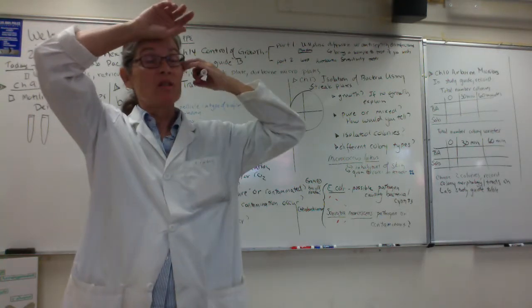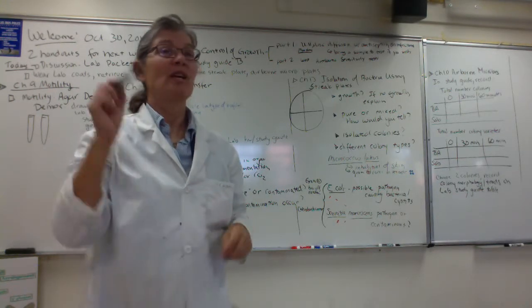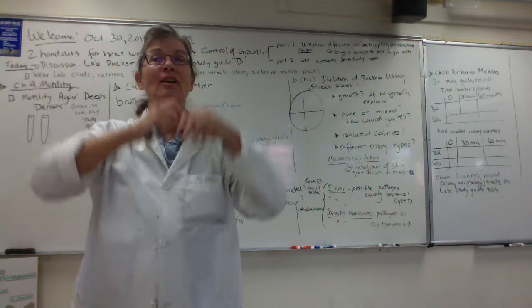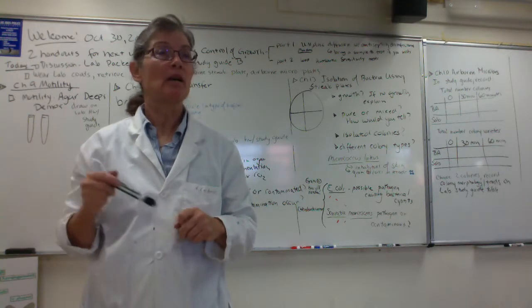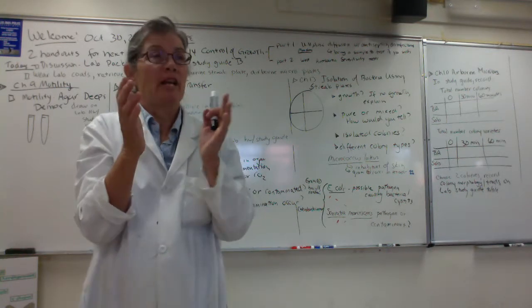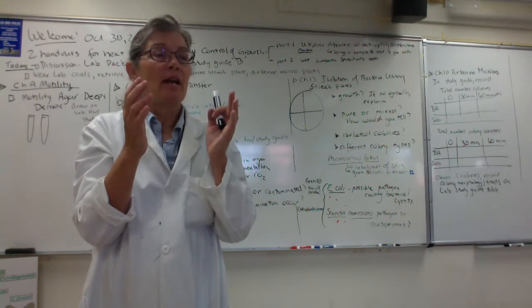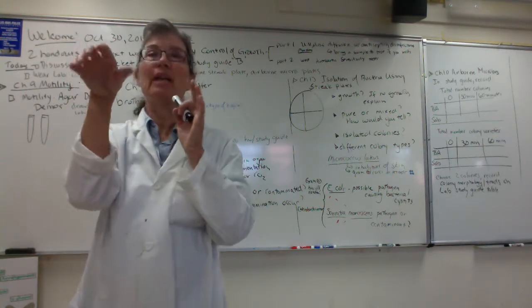Okay, was that Mrs. Pink or Mrs. Blue? That was Miss Pink. Okay, so you guys, those great big colonies, those are E. coli. And they are a big suspect for causing bacterial cystitis. And remember, you guys, how we were talking about in women, we're not engineered that great, in that the opening of the urethra is really close to the opening of the anus, right?